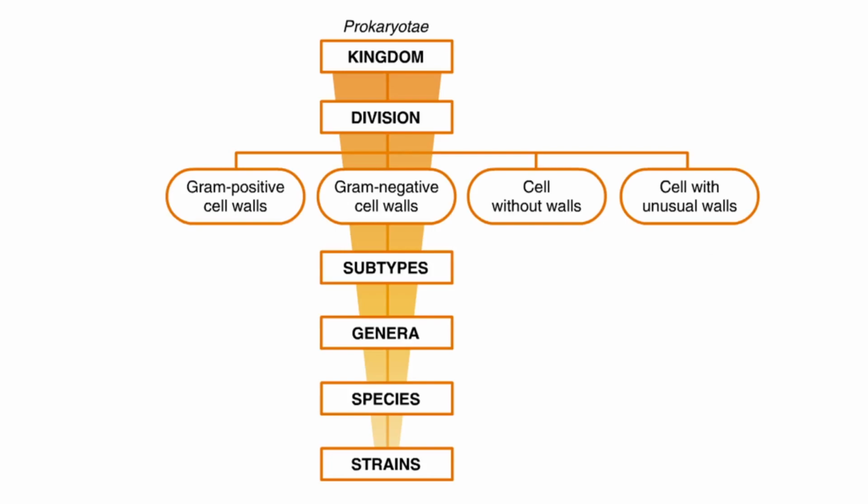Groups of bacteria are often divided into different genera and are grouped together based on very similar characteristics. These characteristics are often the different enzymes that they have. This can be hugely influential and beneficial for identification because it enables us to present chemical scenarios to microbes and see how the bacteria respond.